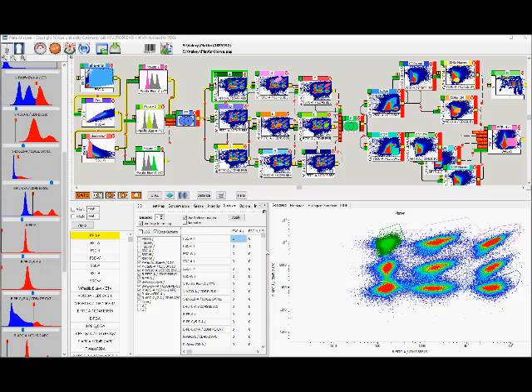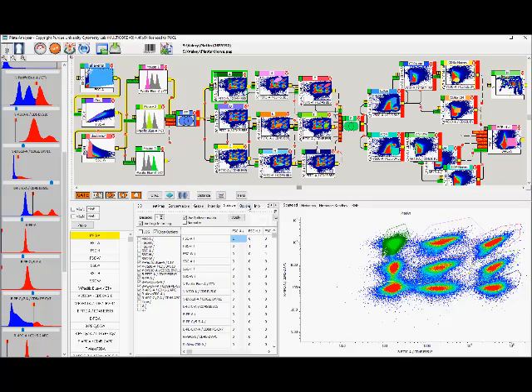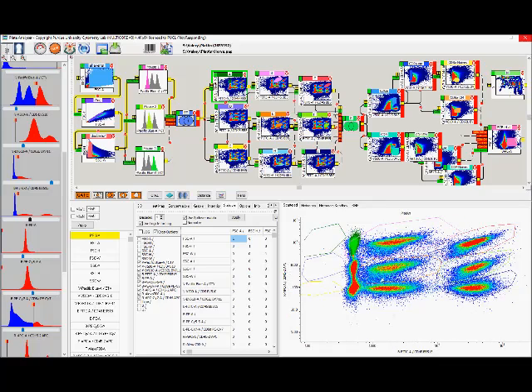Just one more thing to explain, and that is when you open the spillover table here, you see use logical. So if you use logical, you get these sliders. If it's just use regular log, you don't get them. And this way we can manipulate these. So we don't want to change these once we've set up a map, but I'm going to do it anyway. So if we go to CD45 and we change this, you'll see that if we change that here, this is now going to recalculate, and you see these have all moved.